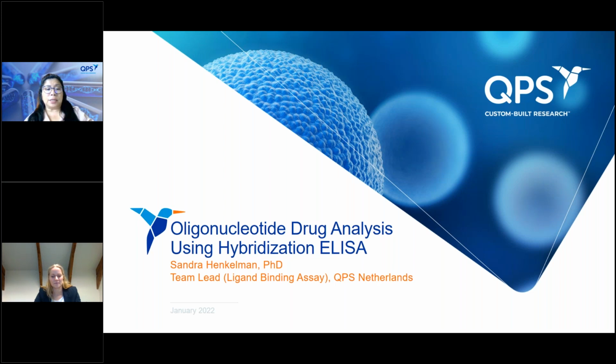This webinar will discuss the analysis of oligonucleotides by hybridization ELISA assays and how it differs from traditional ELISA immunoassays. It will be presented by Dr. Sandra Henkelman.